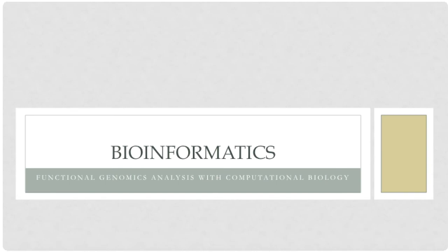So the second part of today's webinar, which will actually take up the majority of the time, will be an actual demonstration of differential expression analysis in R on a data set that I got from online sources. Specifically, we'll be running differential expression analysis, which is a very common tool in bioinformatics, by the way, on microarray data, which measures the mRNA expression in, in this case, an experiment where the treatment could produce differential expression in genes in the two conditions.